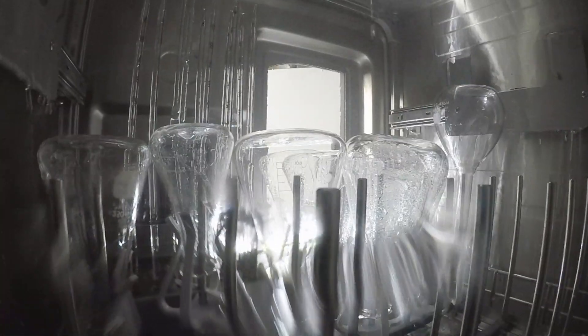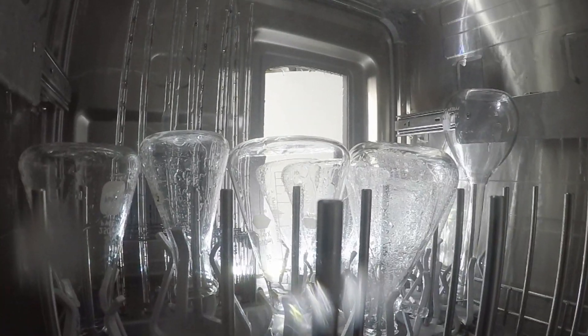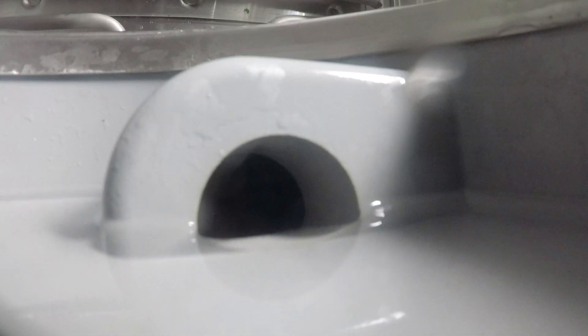Water and detergent are delivered directly where they're needed most. Narrow neck glassware like volumetric flasks are cleaned using direct injection spindles. Test tubes and pipettes are also thoroughly cleaned inside and out. Separate drain and fill pumps prevent cross-contamination, and clean water fills the hygienic heating reservoir for each cycle.